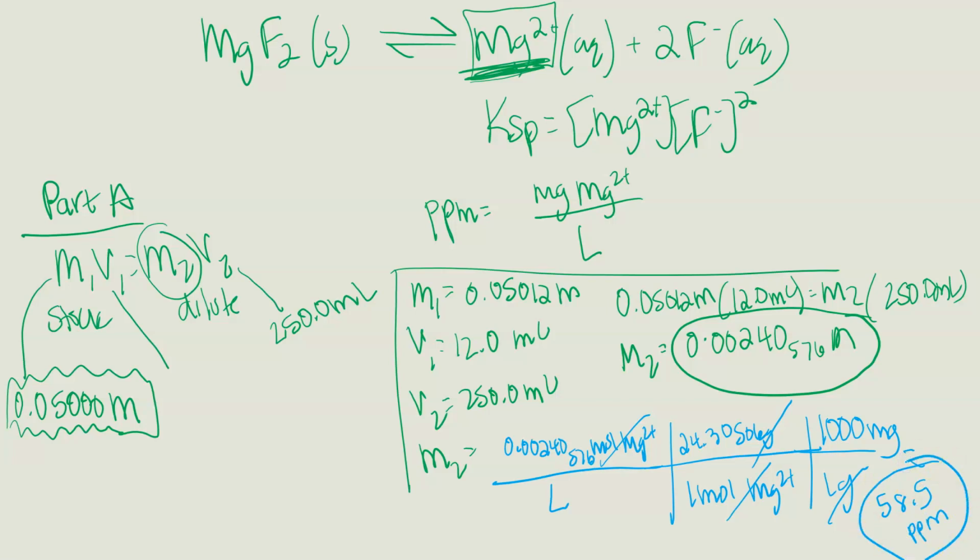So to go from the molarity to the parts per million, you have to convert each molarity into parts per million. The only thing that's going to change is the starting number. Molar mass of magnesium, always true. Grams to milligrams, always true. So you're just going to have to change those. You are going to have to do the parts per million calculations in part A before you're able to use the instrument. Okay, so you have to do that math before you can use the instrument. The absorbance column is coming from the instrument. So that's not a calculated thing.